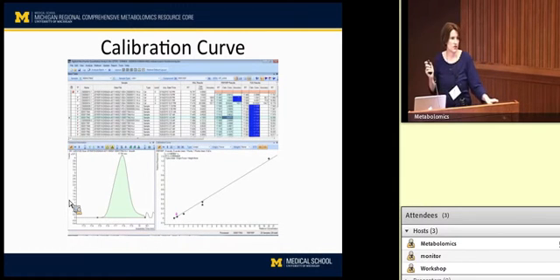One of the questions yesterday was about how you deal with matrix effects between the calibration standards that are used here and the ones in the sample. I also wanted to follow up on that a little bit and say, besides normalizing what's in the samples with an internal standard, that internal standard is actually in the calibration run as well. So we can actually normalize from the neat standard back to the sample as well.